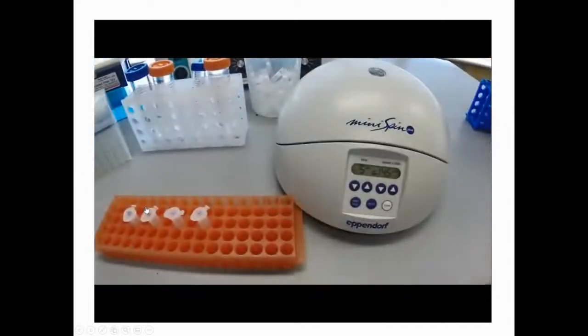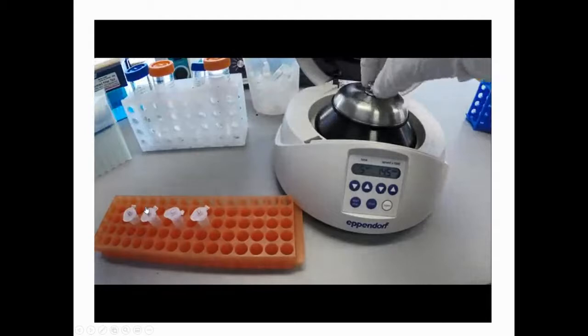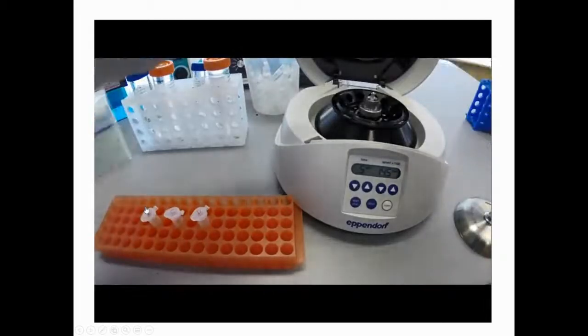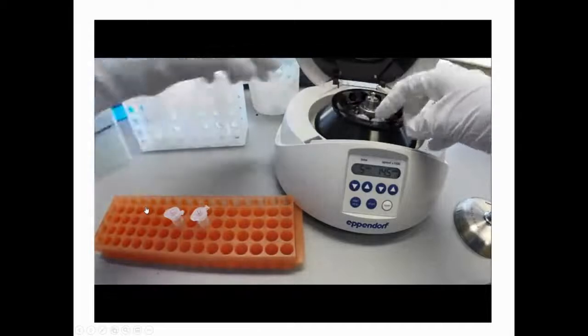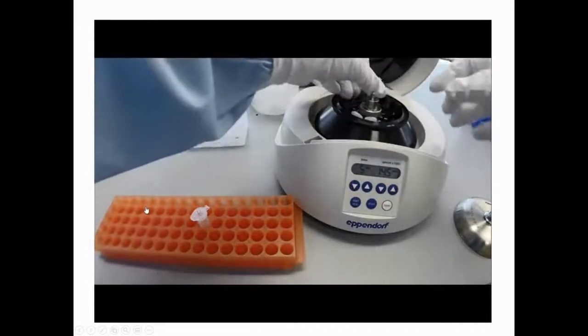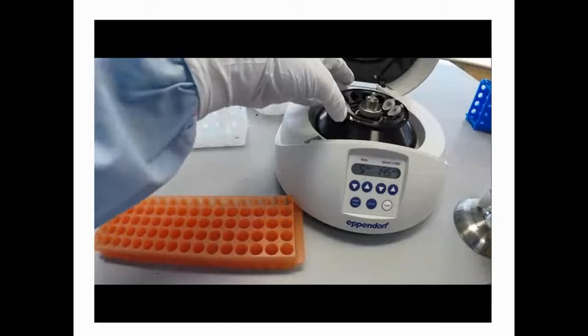After incubating at room temperature for 5 minutes, place the samples in the microcentrifuge with the hinges facing outward. Remember to balance your tubes. And then, as you can see, she placed the tubes in opposite directions so they can balance the rotor.